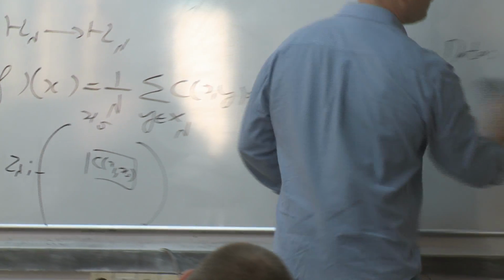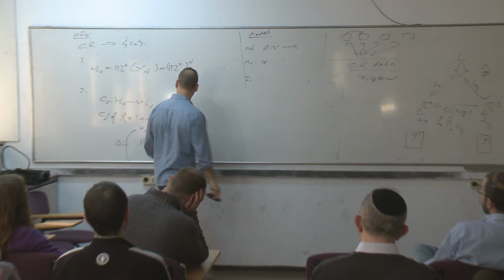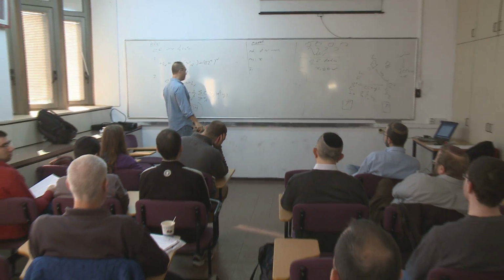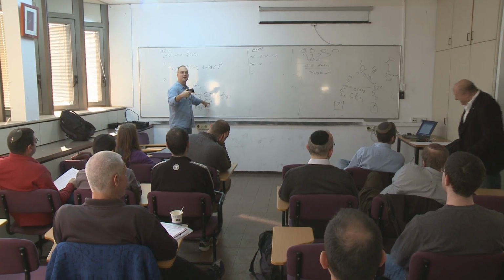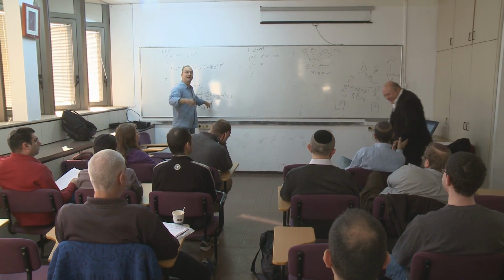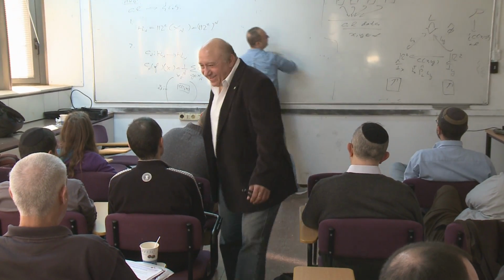Okay? And finally, this is the core of the algorithm. What do you sum over again? You sum over Xn. Xn is the set of labels. Remember, the images are labeled by frames, and this is just the set of labels. Okay?